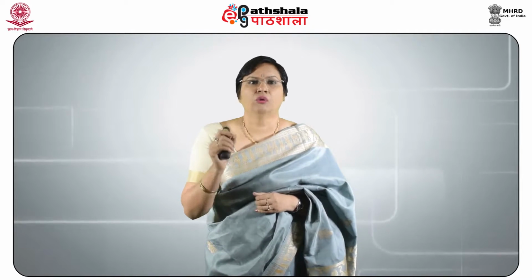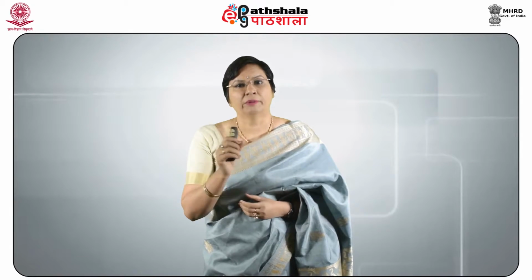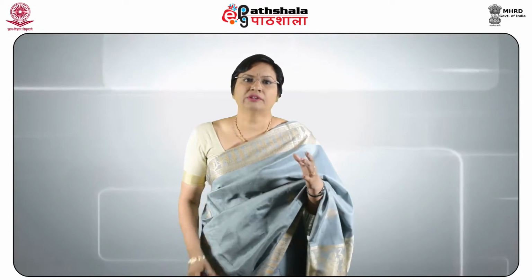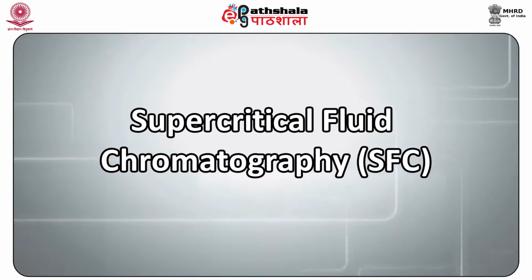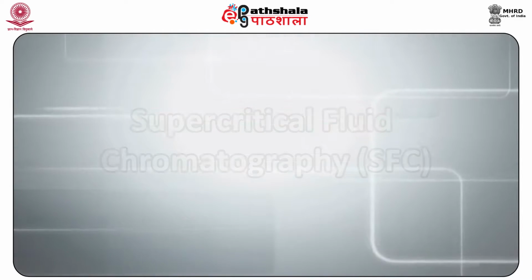Impregnation, the oldest procedure for immobilizing a liquid on a porous material, is a technique now outdated because of the imminent possibility of washing out the column, which is called bleeding. Let us now understand another chromatographic technique, which is supercritical fluid chromatography.